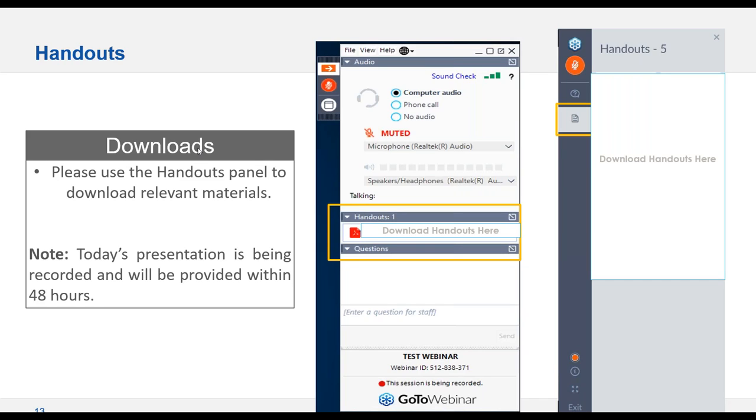Yeah, that's a good point. Do a 1 to 2 with solvent with no internal standard, then do your normal 1 to 10, right? Yep, for sure. That's a good point.